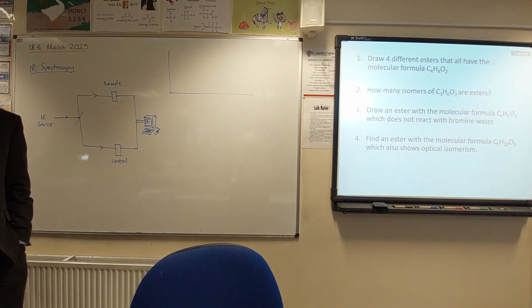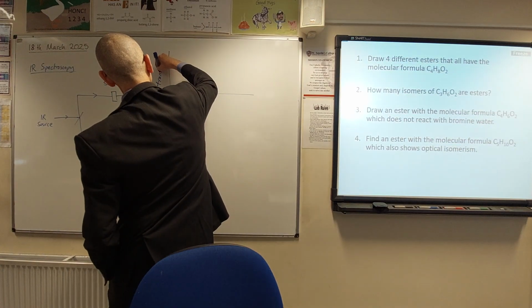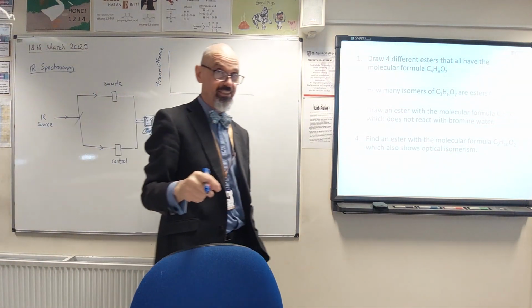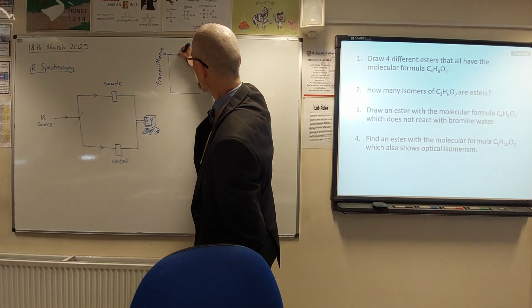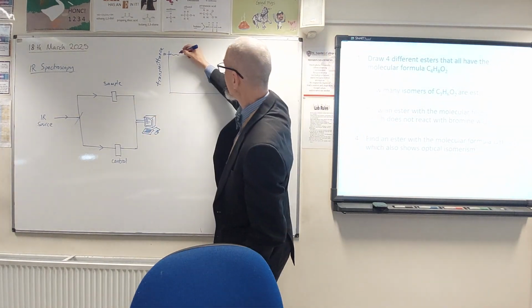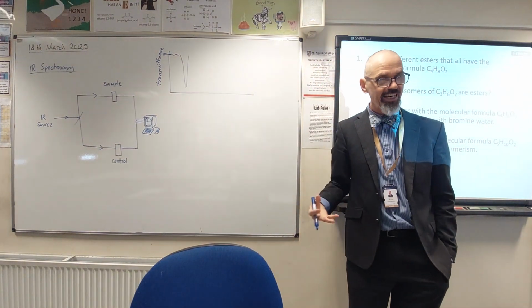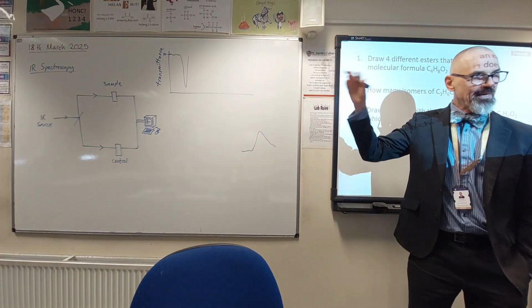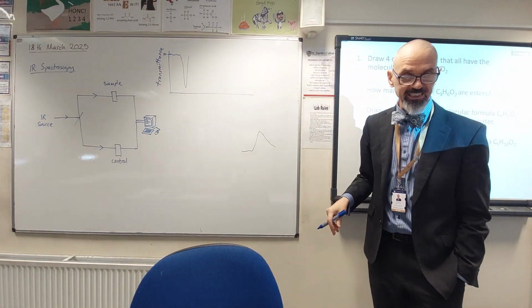So the spectrum appears as what is it called? Transmittance, which is an odd word to use. It's about how much of the light is transmitted. So if 100% of the light goes through the sample, the spectrum will be up at the top. If the sample absorbs all of the light, or some of the light, then you get a big dip. Now we call the dip a peak, even though really peaks are the other way up, aren't they? The peak of a mountain is usually above you, not below you. But despite that, we call them peaks.